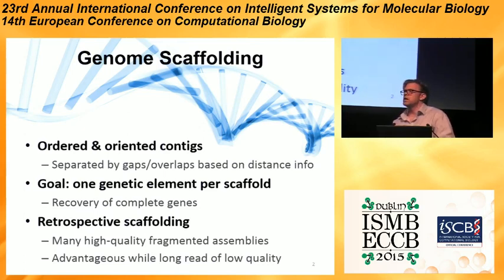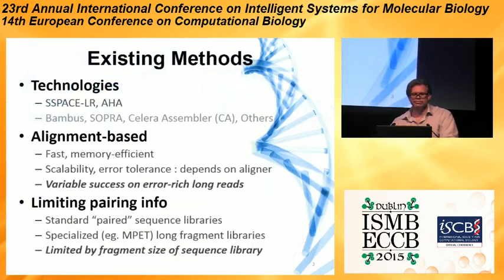Again, there are really good resources out there because sequencing technologies have enabled the rapid and cheap sequencing of genomes. Unfortunately, a lot of these genome assemblies are fragmented, but they're out there, and now with emerging long read technology, some of which has been out for a while now, such as PacBio, you can actually use these long reads to rescaffold existing genomes.